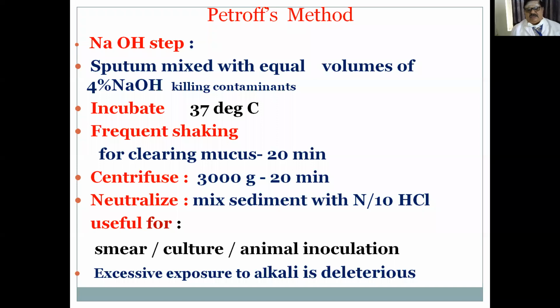And you also neutralize by mixing N/10 hydrochloric acid with the sediment, because earlier you had added sodium hydroxide. So to neutralize, you add a weak acid, N/10 hydrochloric acid. Once you concentrate, what is the use? You can do a smear, you can do the culture, or you can do an animal inoculation also. But excessive exposure to alkali is deleterious, so don't expose too much to the alkali.